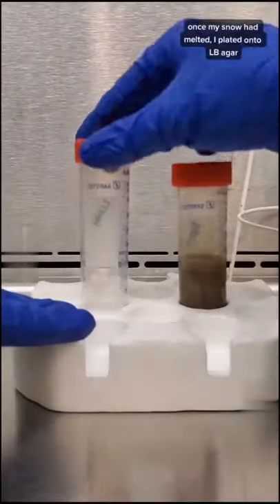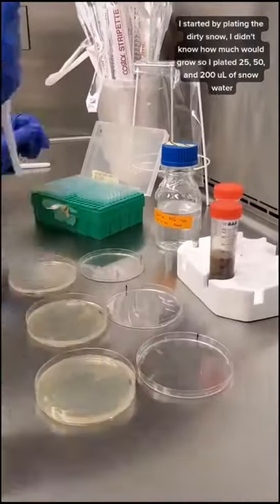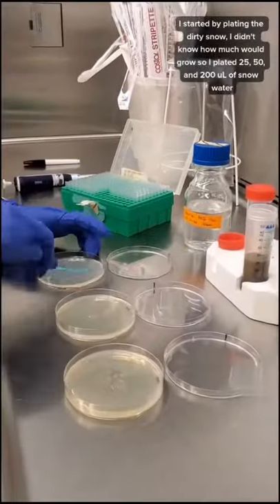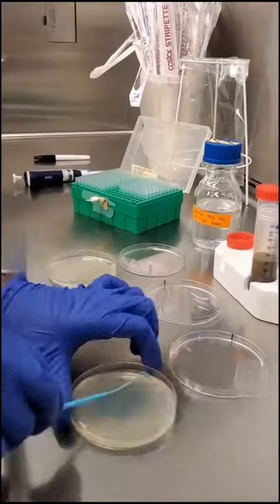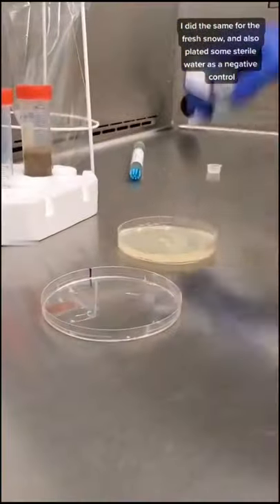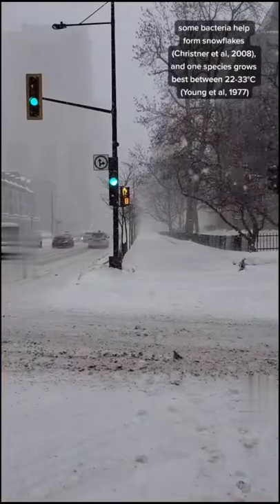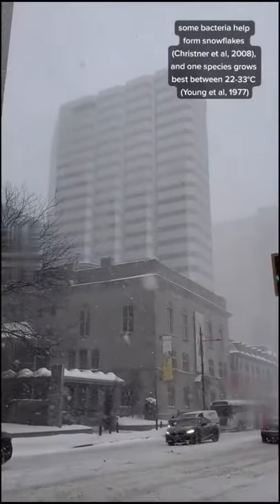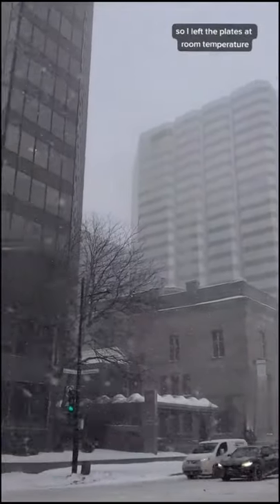Once my snow had melted, I plated onto LB agar. I started by plating the dirty snow — I didn't know how much would grow, so I plated 25, 50, and 200 microliters of snow water. I did the same for the fresh snow and also plated some sterile water as a negative control. Some bacteria help form snowflakes, and one species grows best between 22 and 33 degrees Celsius, so I left the plates at room temperature.